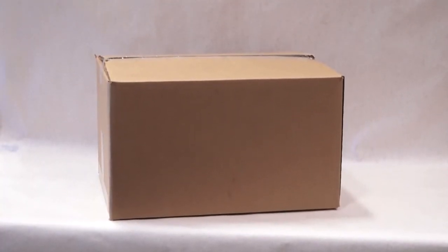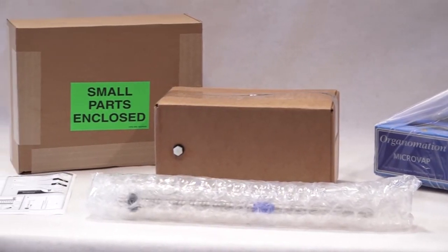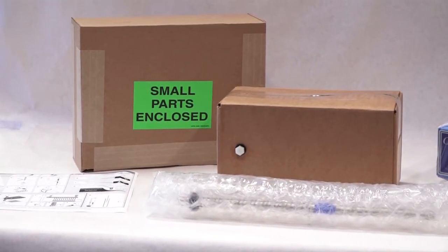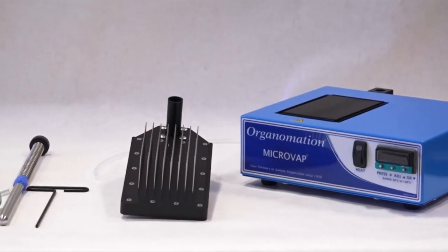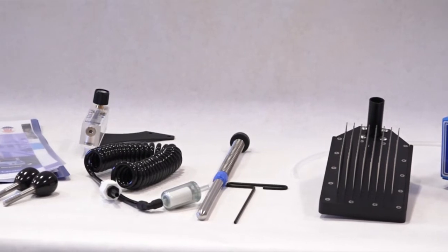First, carefully check the contents of all cartons received for damages which may have occurred in transit. Retain all cartons and packing materials until the instrument has been assembled and tested. Contact Organimation immediately if any damages or discrepancies are found.